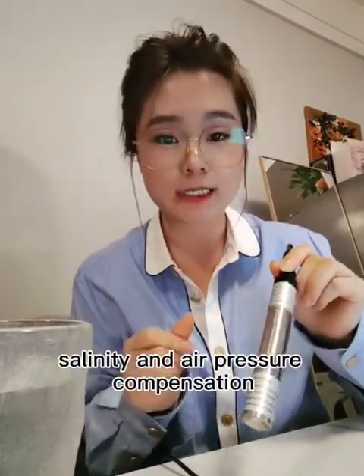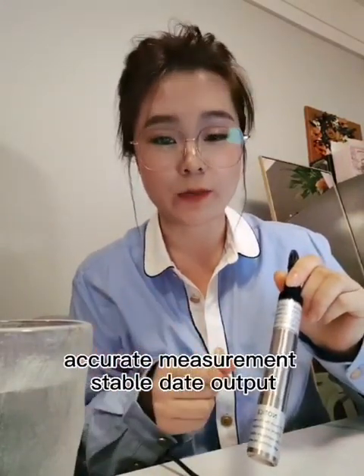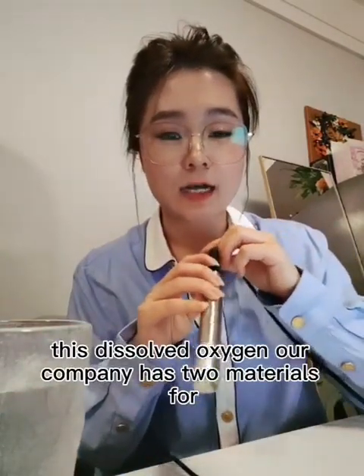It has temperature, salinity, and air pressure compensation, accurate measurement, and stable data output.